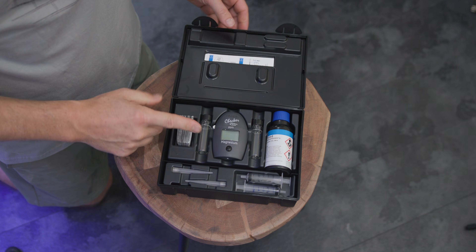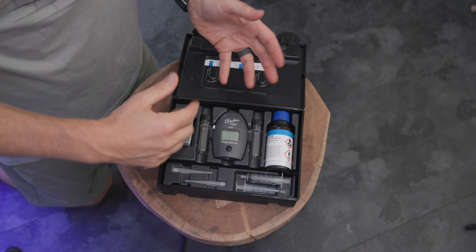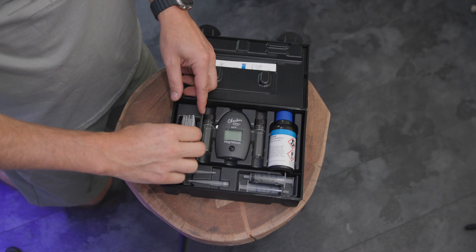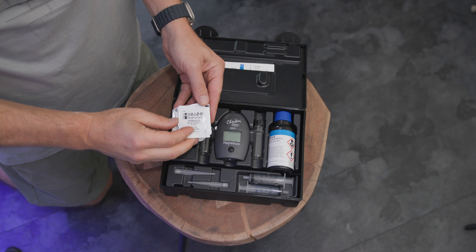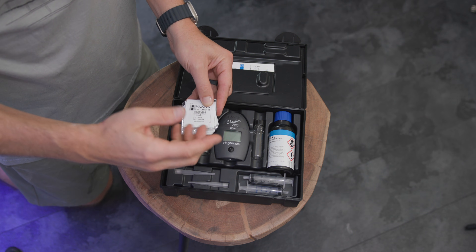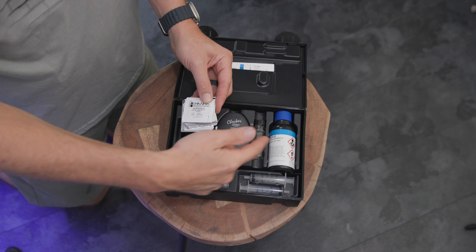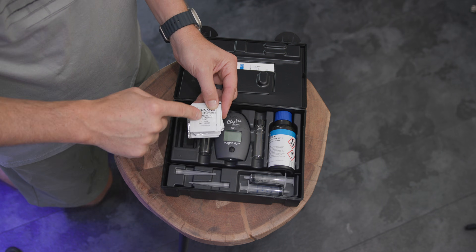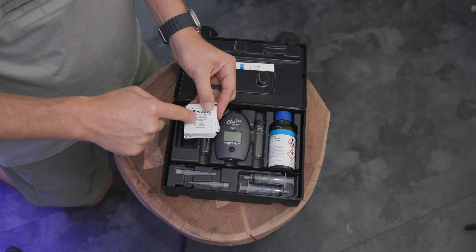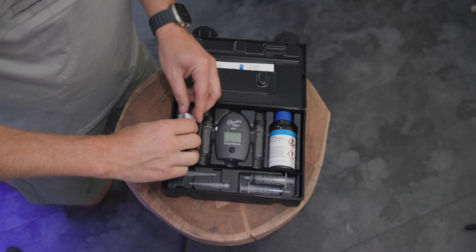This means powdered reagent. The old version had two liquid reagents. Liquids are easier than powders, but if this is what we're doing now to make it more accurate, okay. So if you open one of these up and you have two liquids, that means it's the old one. The new one has better shelf life in powder form, so it's going to have a powder and a liquid. Keep that in mind.